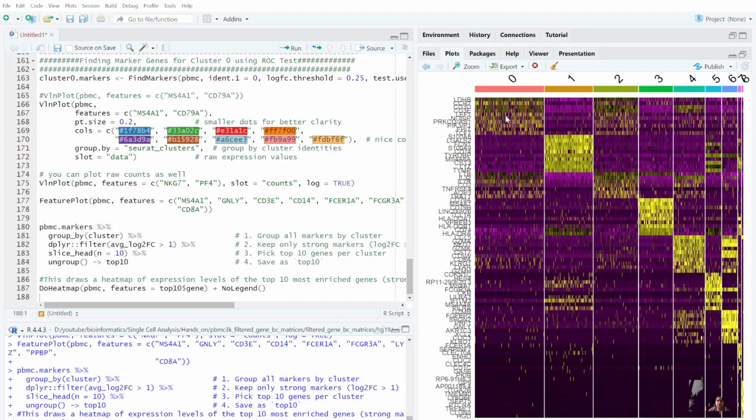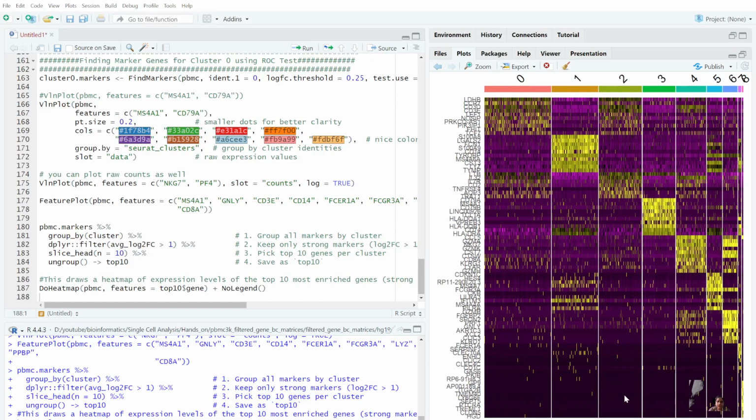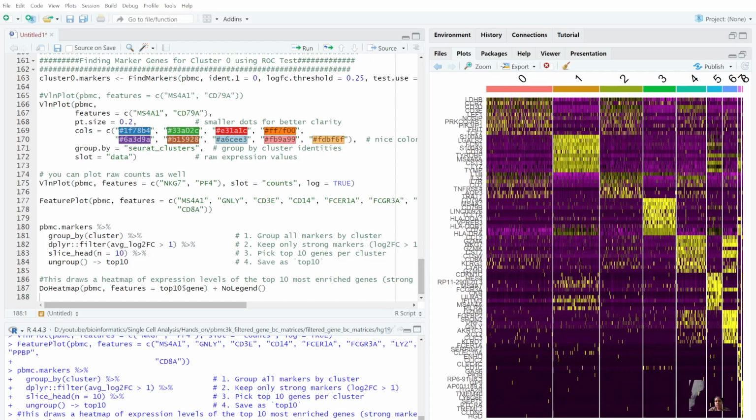These are the top 10 genes of cluster 0, then cluster 1, 2, 3, and you see these genes are co-expressed with these genes, if you can follow my cursor over here. All these things you can interpret. There are disturbances, but I hope you don't mind them.